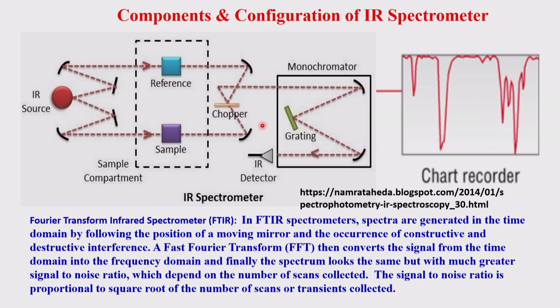What you are getting out is called the transmission. So what you're measuring is transmission. 1 minus transmission is absorption. Sometimes the spectra are shown in absorption mode, but in most cases an infrared spectrum is shown in transmission mode.